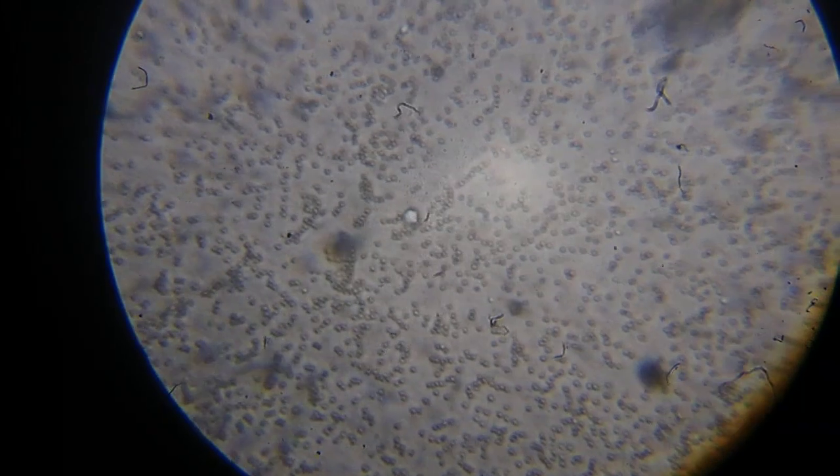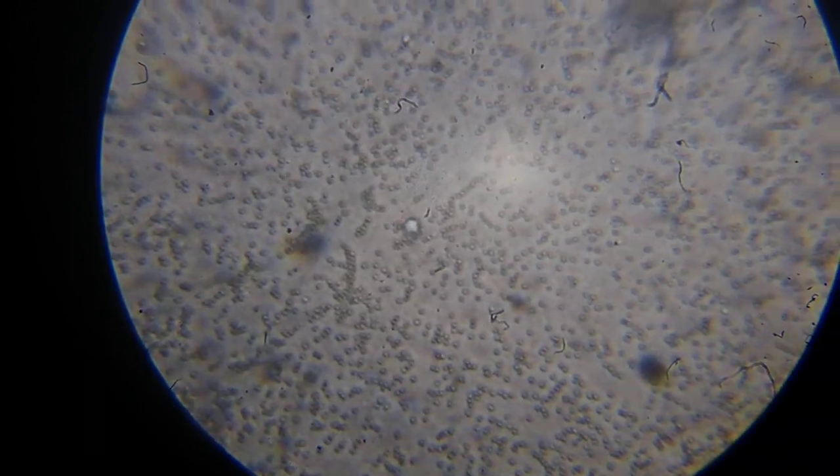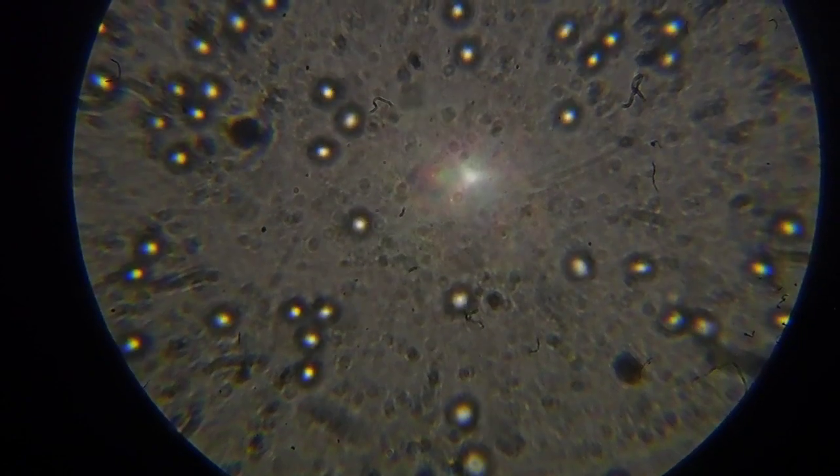These are rings, as we expected to see in a red blood sample. Correct me if I'm wrong, but that's according to my knowledge. That's what you would expect to see in such a sample. Yes, these are certainly not nerves, these are red blood cells.